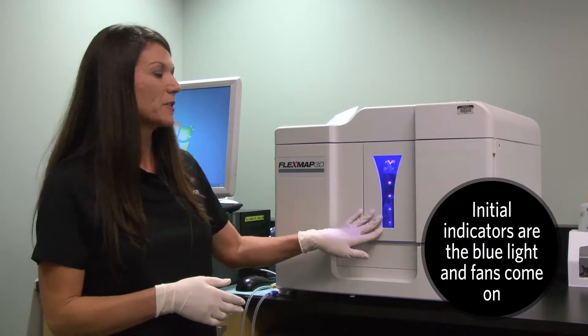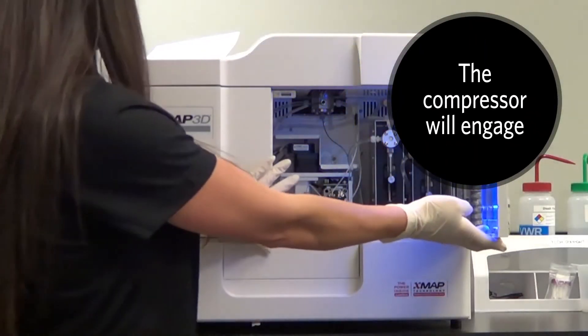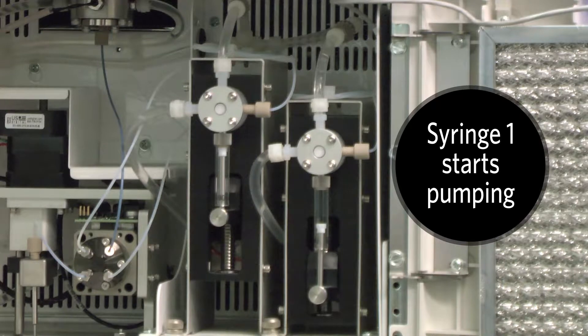So once the instrument is on, the first thing you're going to see is the blue light. You'll also hear the compressor engage, as well as the sample valve. And here the sample syringe is now pumping — this is syringe 1.